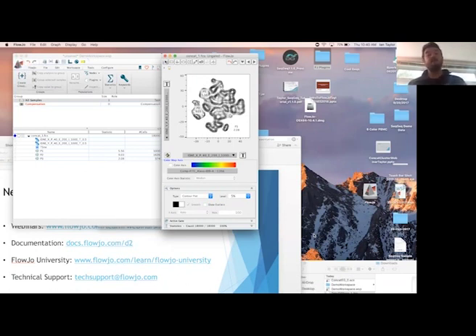But absolutely, you can run t-SNE multiple times on the same sample. Sometimes there's a subset that's quite large, and you may want to run t-SNE again on that subpopulation to do further exploration and discovery on it. Also depends on the number of parameters, right? Because here we only have a few parameters. It's probably not a huge deal to look through them all once we've done t-SNE. But in some cases, that will be a challenging task.